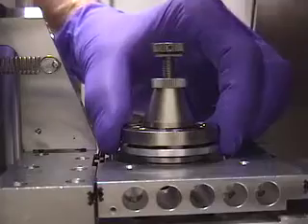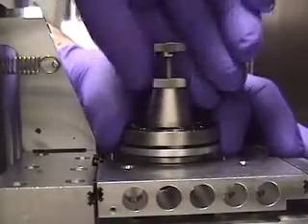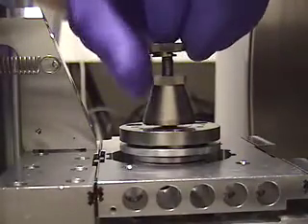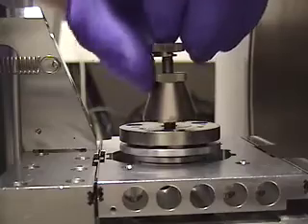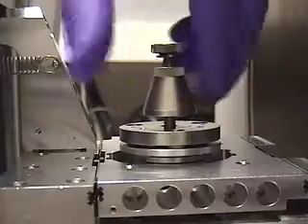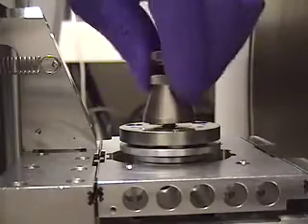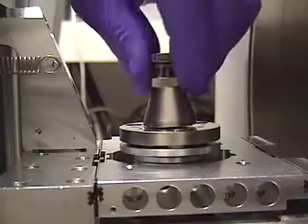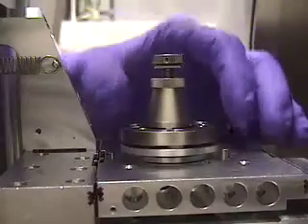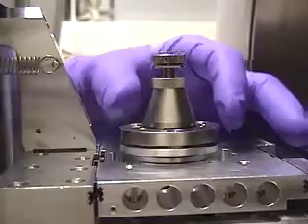To make adjustments to the specimen mounting height, first grip the rotation axis with one hand and undo the lock nut of the specimen holder with the other. The lock nut may then be moved freely up and down on the screwed rod, and the screwed rod screwed in and out to change the sample height. Once the required height has been reached, the lock nut may be wound down and gently locked into position, again holding the rotation axis to prevent damage to its gearing.